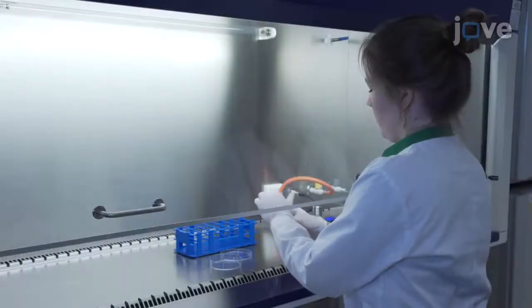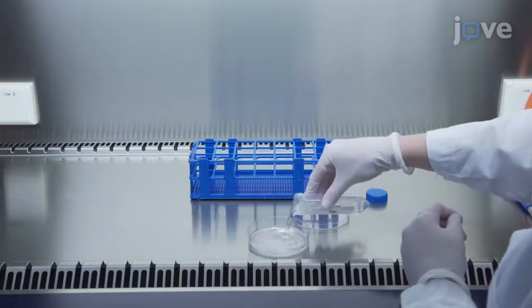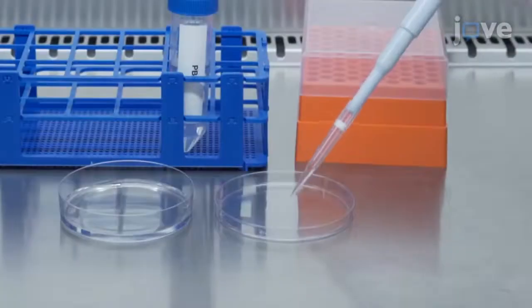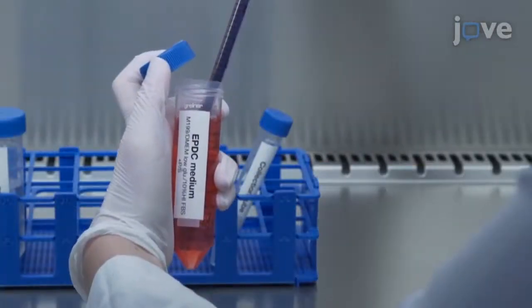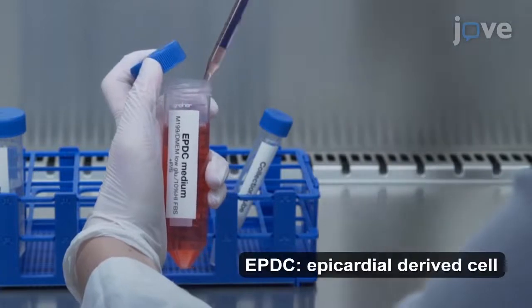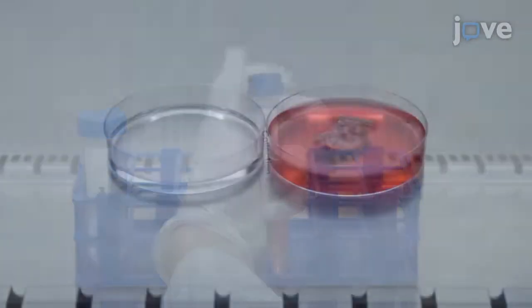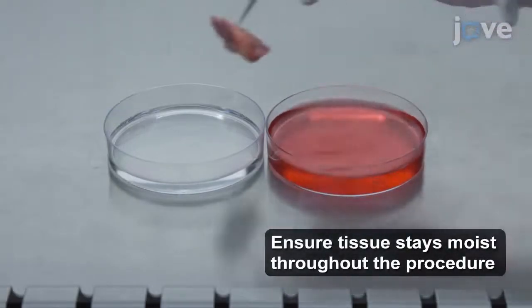To begin, fill a 100-millimeter cell culture dish with PBS inside the laminar flow cabinet. Place approximately 200 microliters of PBS into the lid. Then add 5 milliliters of pre-warmed EPDC medium to a 15-milliliter tube. Place the cardiac tissue, isolated from an adult human heart, in the dish.